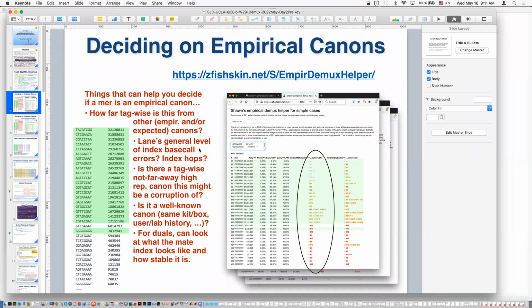And again, you view this tolerance from the first point in terms of how close the original design was. If the design is like 5 mismatches apart, the full boxes it comes from, and even the full boxes are very far apart, then obviously you're going to be more willing to accept things that are further apart in the empirical list as really just being variants of something else. So these things are just controlling how you interpret the closeness information.